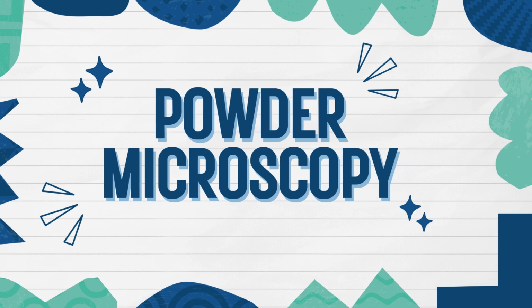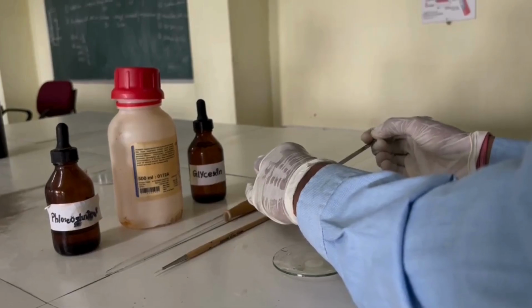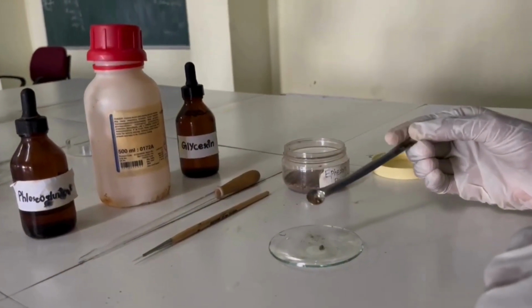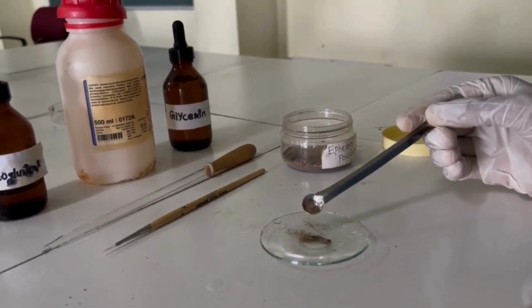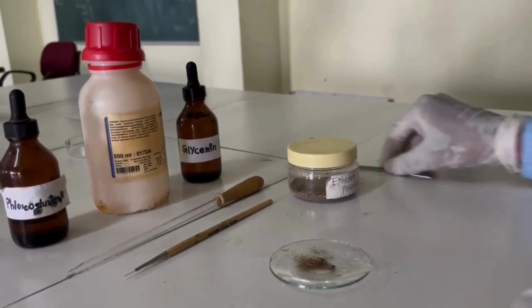Powder microscopy. At first the powder drug is added to the phloroglucinol and HCl mixture. Adding drug to this mixture enhances visibility of certain cellular components and structure.